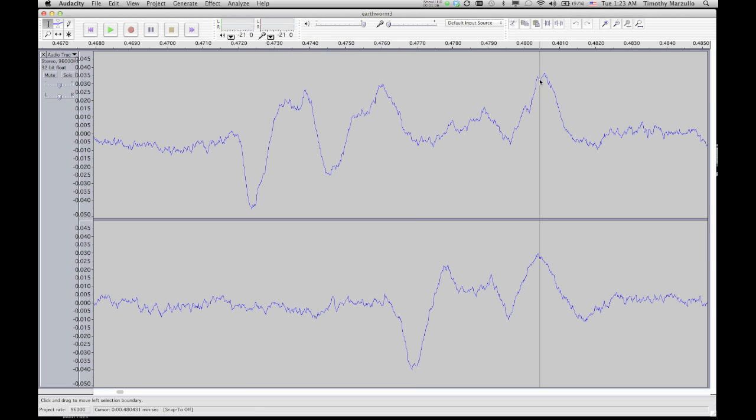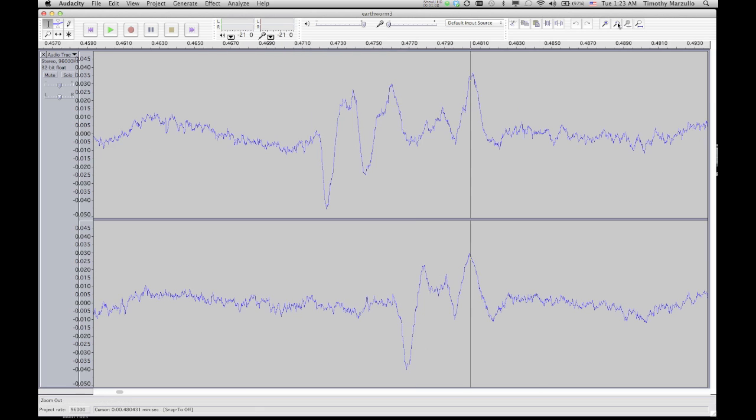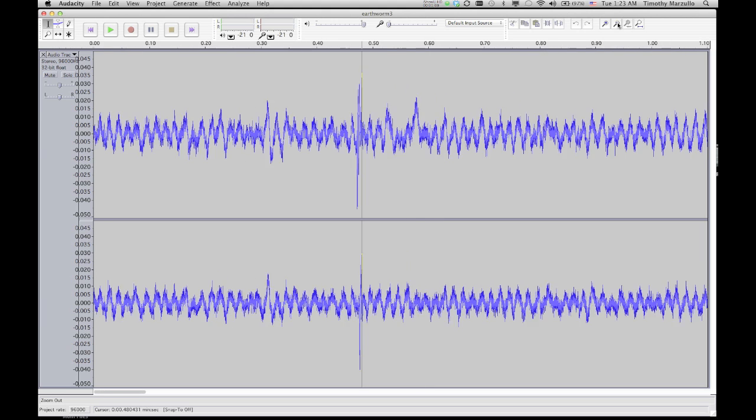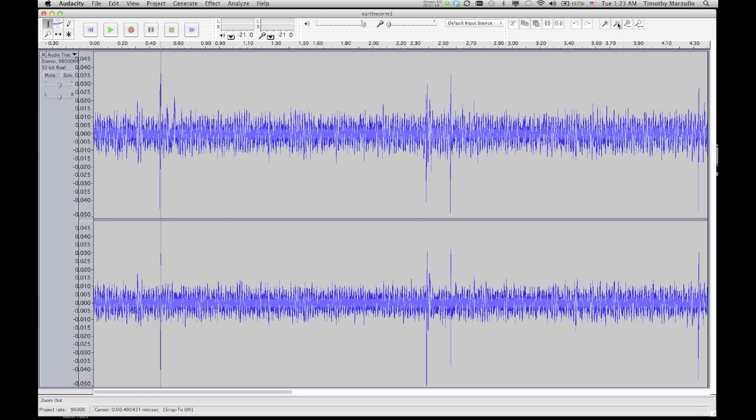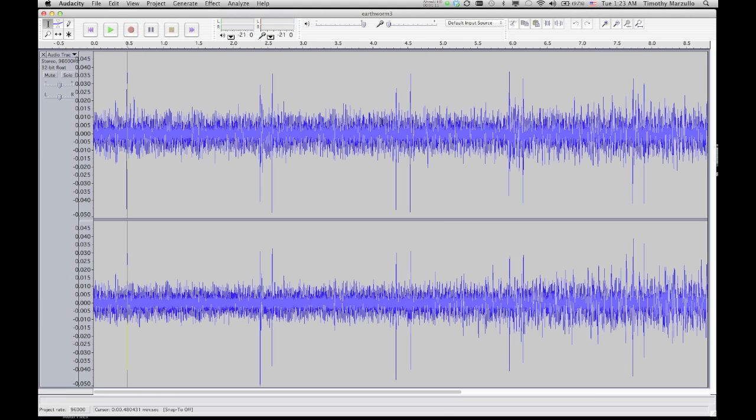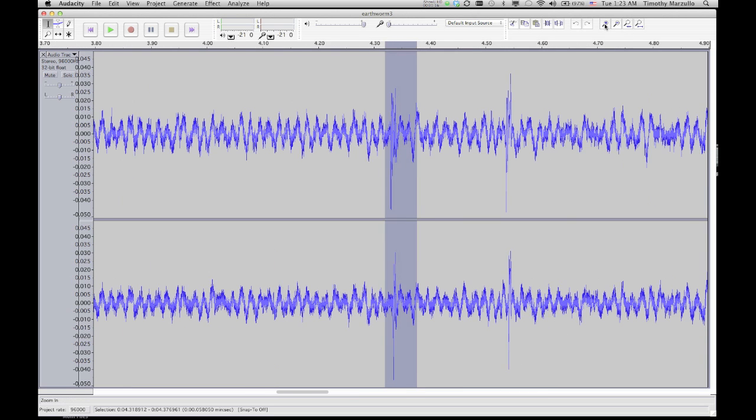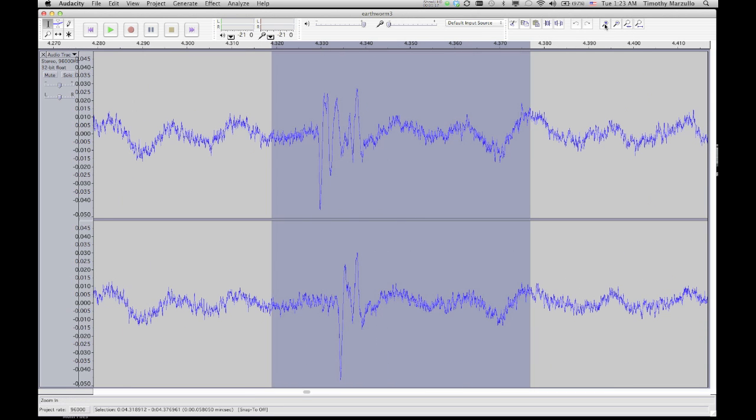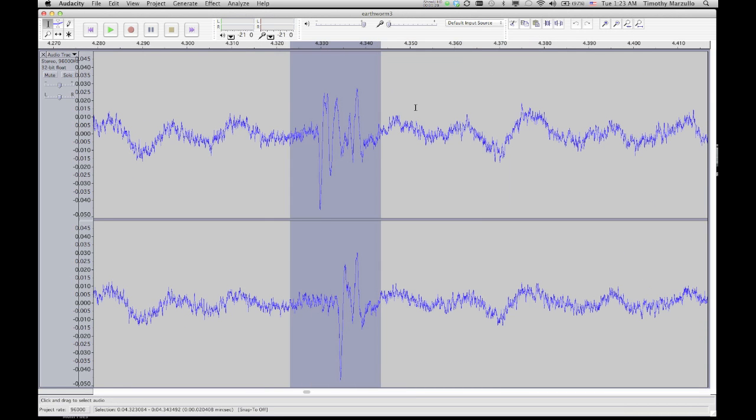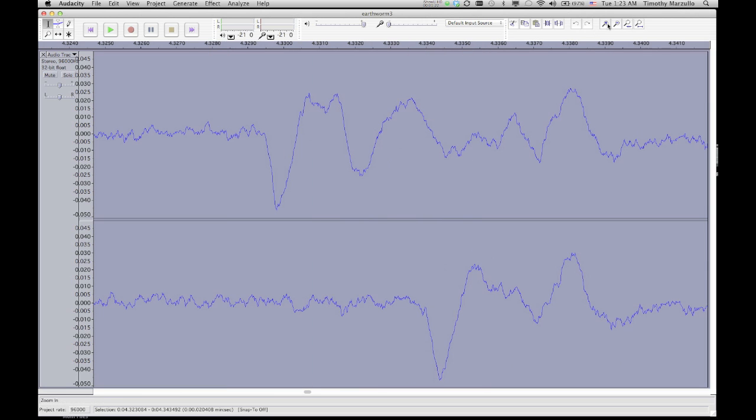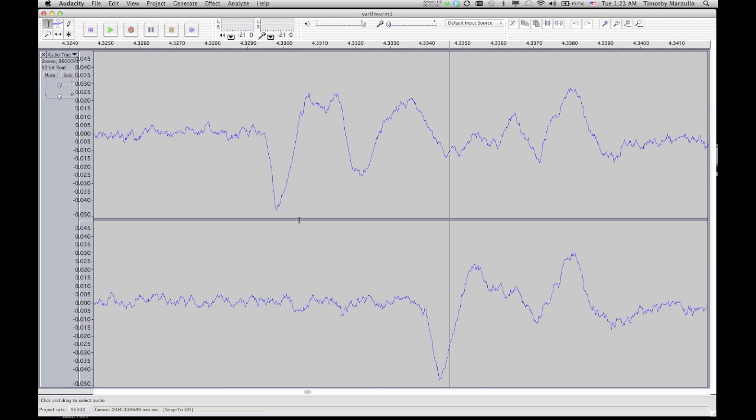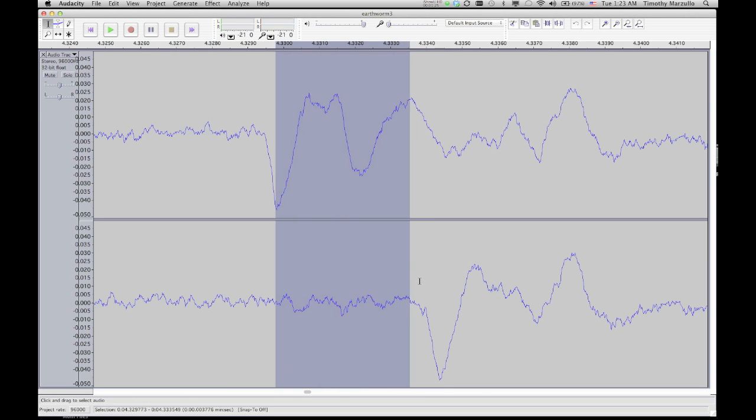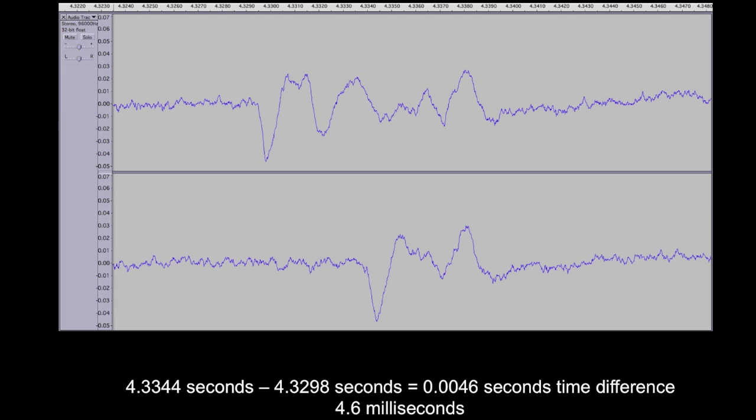I can do this analysis for every single spike in the recording. I'm going to zoom out of my recording here and pick a different spike to do my analysis. Focusing back in on a very tight timescale, I see again the lag between the top and bottom channels. And again, I can measure the difference between the dip on the first channel and the dip on the second channel. I come up with a time difference of 4.6 milliseconds, exactly the same as the previous spike.